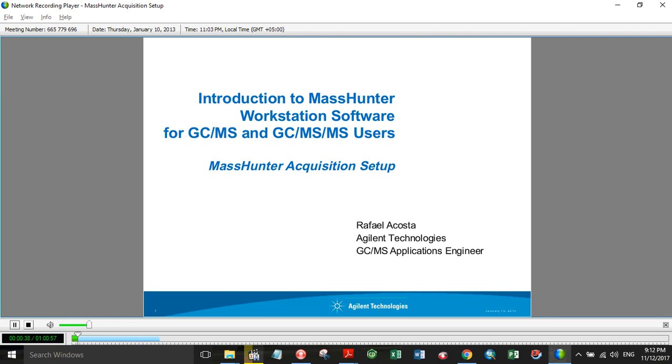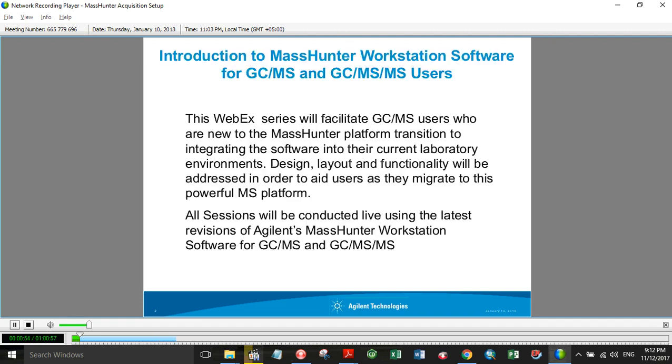Thanks, Rita. It's great to be here today, and thank you all for joining us on this day to learn more about MassHunter acquisition software for GCMS. Today's series will focus on MassHunter acquisition for MS analysis. What we'll do is focus on the design layout and ensure that you gain the most productive experience while using MassHunter acquisition software. All sessions will be conducted live, and they'll be using the latest version of MassHunter workstation software.